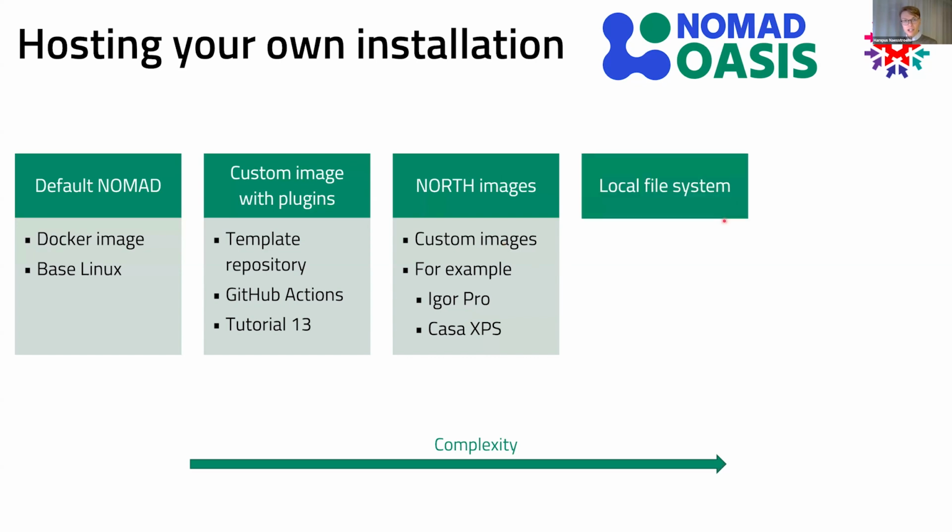And tied into this, that you can work with your local file system, right? So if you have already file shares running on your servers where the users have heavy files, say they're talking about TEM or something like this, right? Where you're talking about terabytes of data, you don't really want to set this up where you move this to the server.